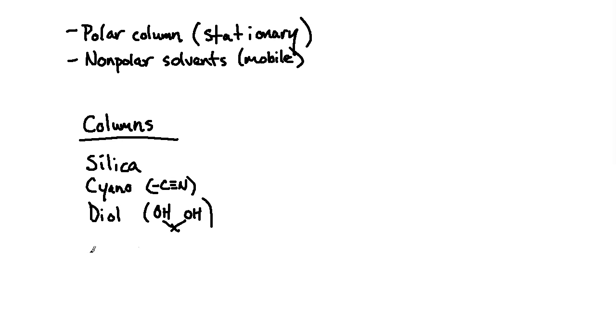And then we can also deal with amino groups. So you could consider some sort of an NH or some sort of an NR, where R is probably a small hydrocarbon, not very large, otherwise we're starting to talk nonpolar again. And those would be some of the base modifications that you could do to these types of columns. And you would get varying degrees of polarity and therefore varying degrees of retention and interactivity with the analytes that are coming across.